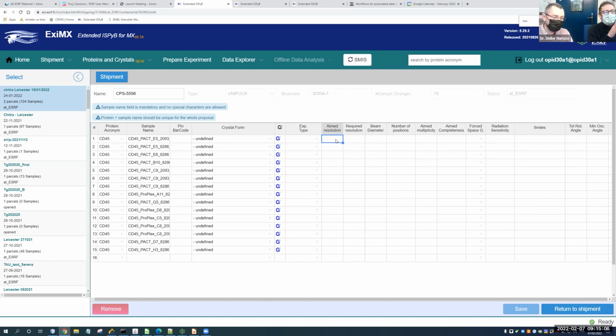If for one reason or another the crystal diffracts more or less, we redo the characterization if needed or not. Obviously, we'll always collect the data set at the best resolution the crystal is diffracting. Still, for doing all this characterization, we go to 2-angstrom if we don't say anything.